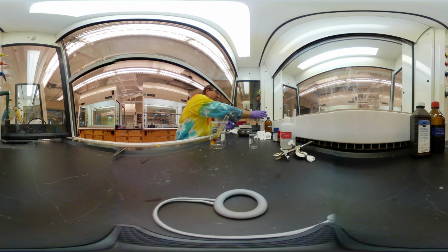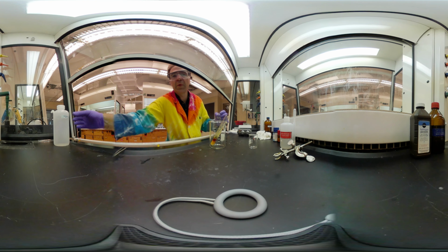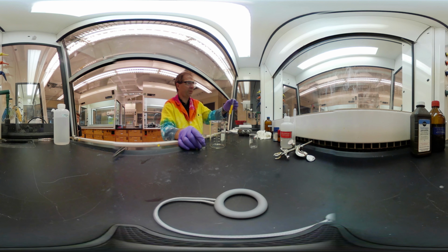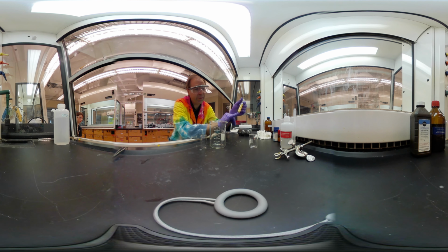All right, so I'm going to once again, as always, use a little bit of my solvent to clean out the container that I had it sitting in, to make sure I rinse over as much as I can. Okay, ooh, that's pretty full. We've gone to yellow. Now, interestingly, I'm actually getting some product forming already. This is, on the bottom here, my luminol.